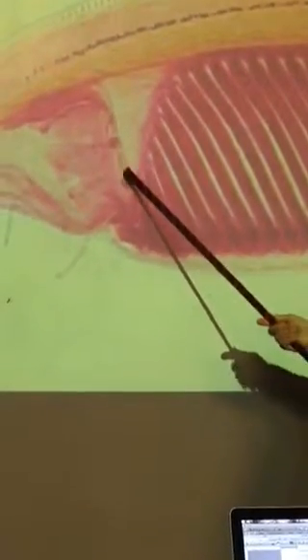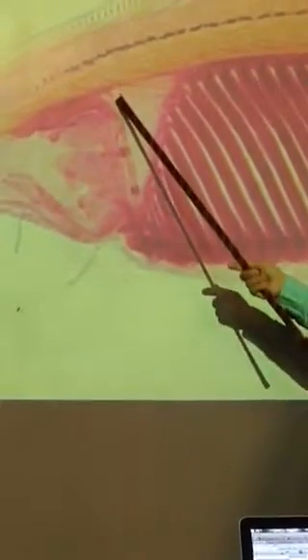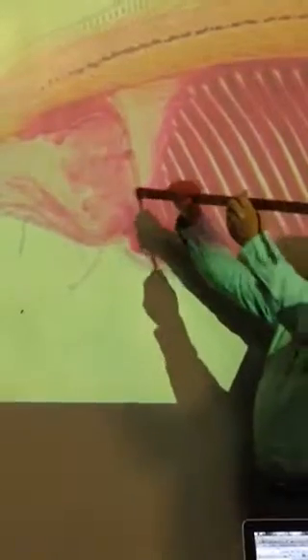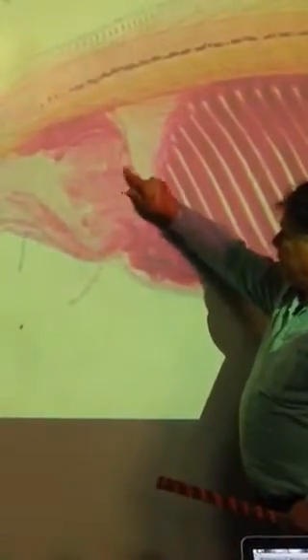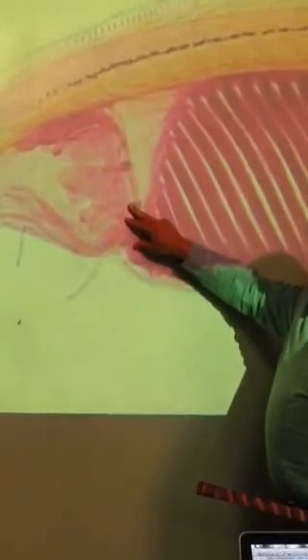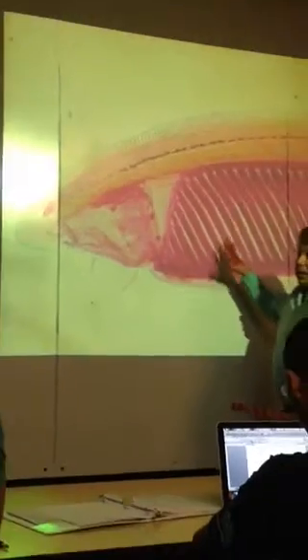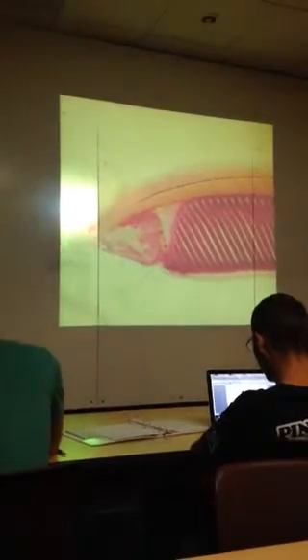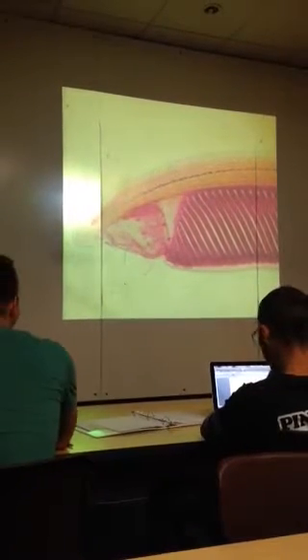See this thing coming down here? That's the velum. And I'm wiggling it on purpose, because coming off of it, there's one coming out like this towards you, probably out like this towards you. There are little things that come off called velar tentacles. And again, I might have a slide that has those really clear. This isn't all my slides. I've got more slides to go through. I gave you a pretty comprehensive set of slides, but I might have some that are even clearer, that I save for test purposes.